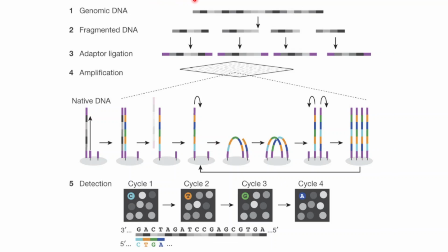So basically, from the organism whose whole genome you want to sequence, you have to isolate the genomic DNA, because that's the prerequisite in this case, right? And then we have to fragment this DNA into shorter inserts or small fragments. You can see that this whole length of genomic DNA is getting shortened down into smaller fragments. Afterwards, to each end of the fragmented DNA, you add a particular sequence called an adapter.